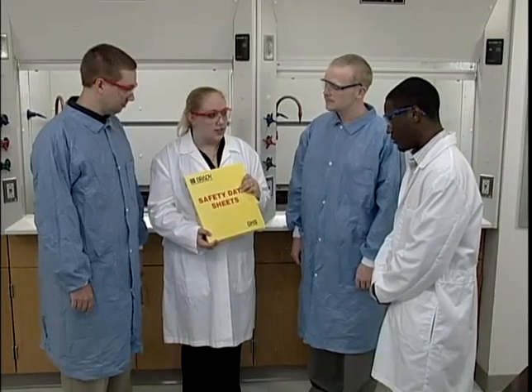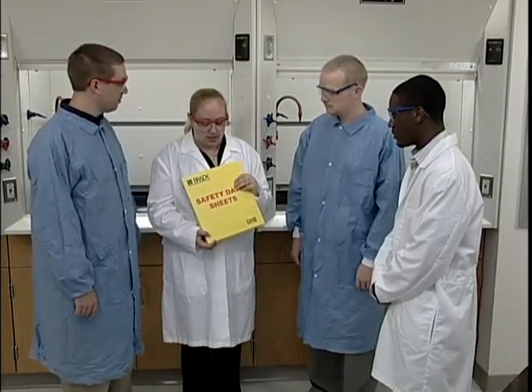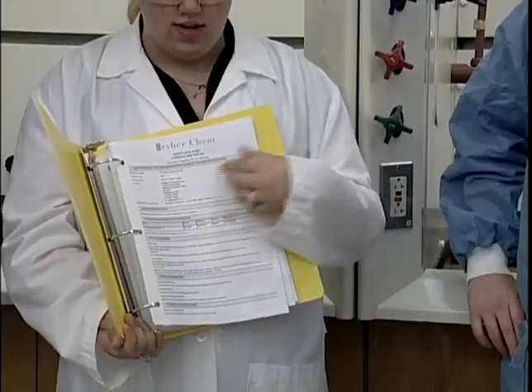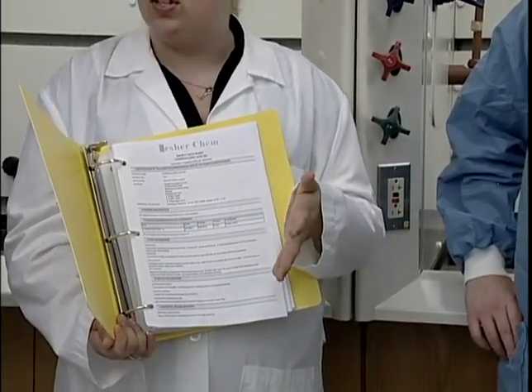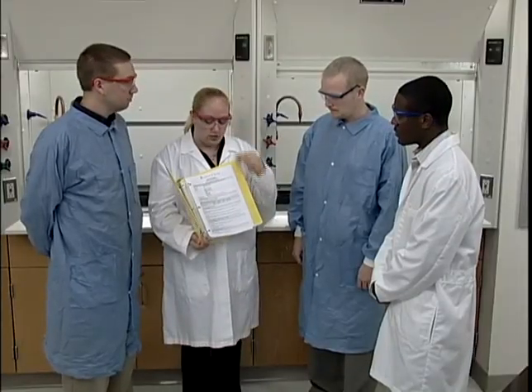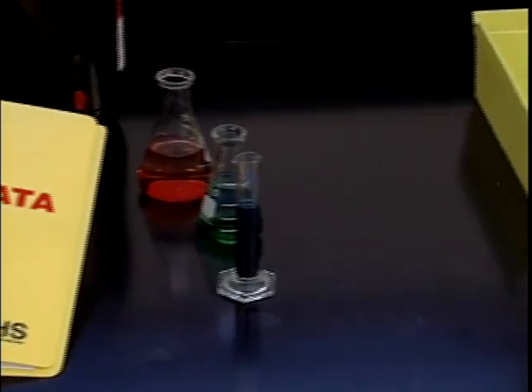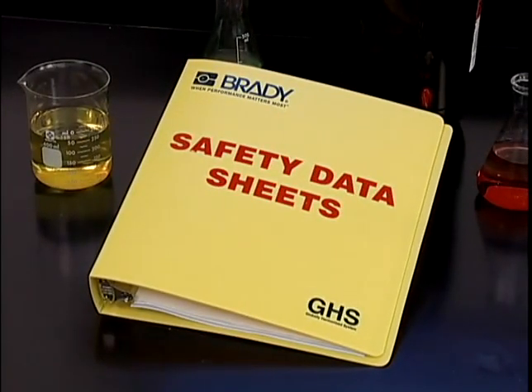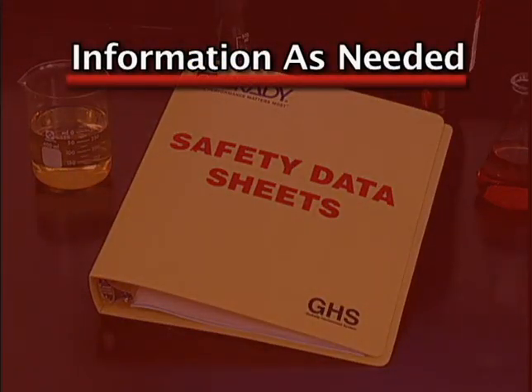For many workers, the GHS safety data sheet will look very familiar. That's because it's formatted almost exactly like one of the versions of the ANSI Material Safety Data Sheet, except for much of the information in sections 2 and 3, whose positions are swapped. So just like ANSI MSDSs, GHS safety data sheets present information in an as-needed order.